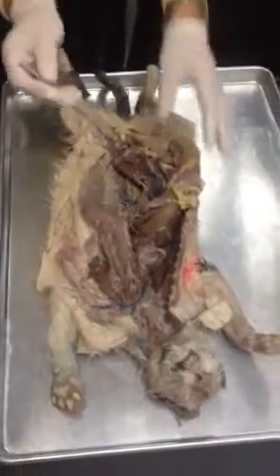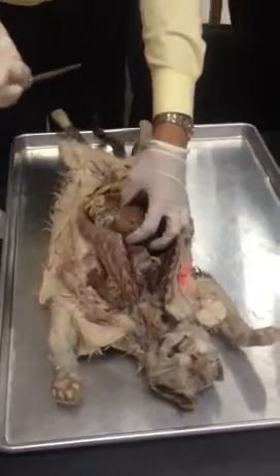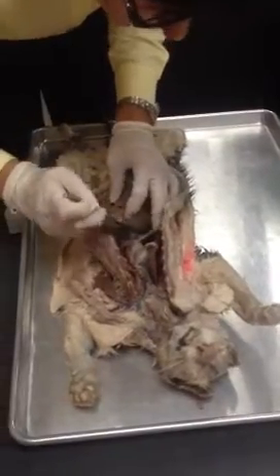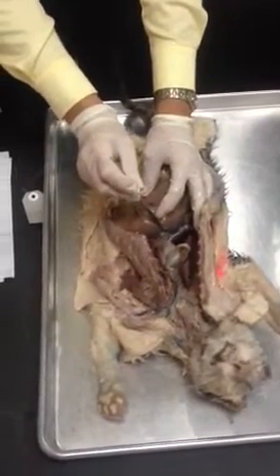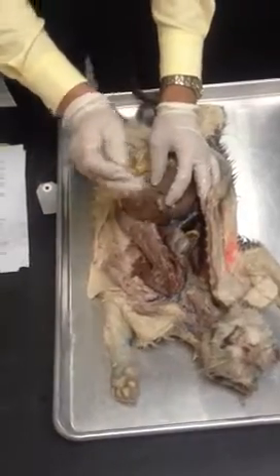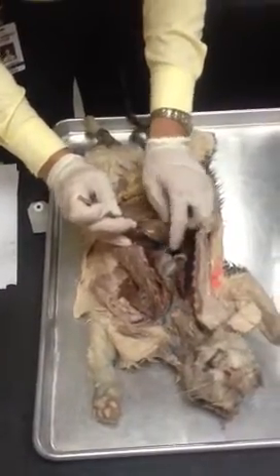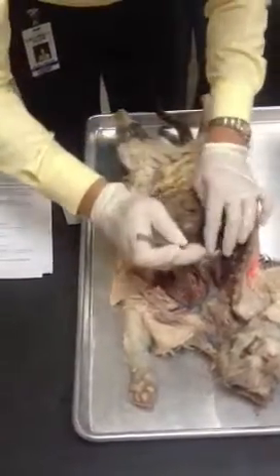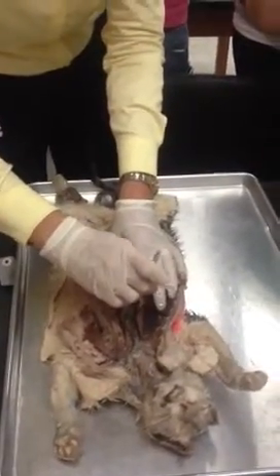In the liver, the blood is poured into the liver sinuses. What are sinuses? Capillaries, right? Type of the capillaries, and then the blood is collected into the hepatic veins. We have as many hepatic veins as we have lobes. In the humans we should have roughly 2, and in the cats we have 7 lobes. That way, there should be 7 hepatic veins, and then those hepatic veins pour the blood into the inferior vena cava, and inferior vena cava brings it to right atrium. Excellent. All right, that would be inferior vena cava. Here we see superior vena cava, again comes to the right atrium.